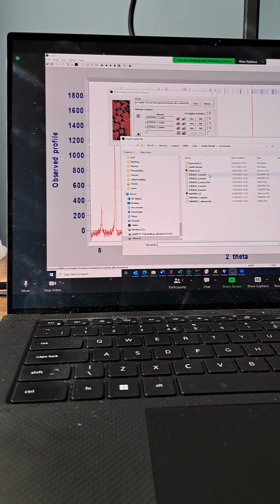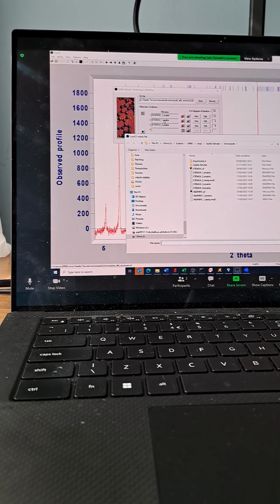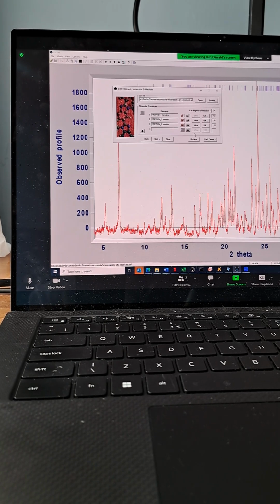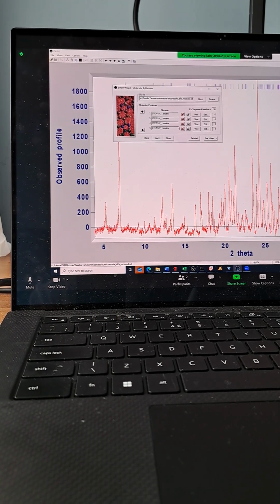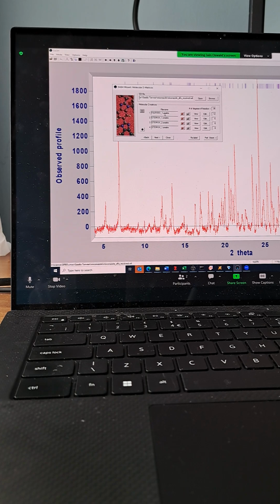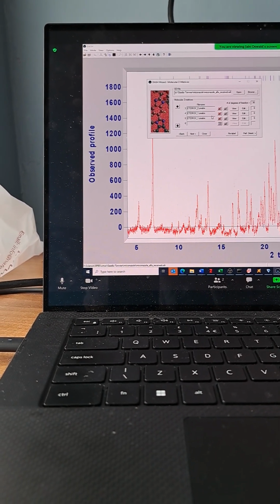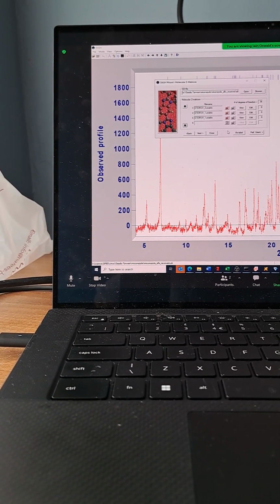on the blank tab here, what you'll have are your Z matrices. So you can see Z matrix 1 and 2. You could import either one of these, and that adds in another nitrate or water. If we want to add in another one, you open up and highlight that Z matrix. And therefore you have, say, four nitrates or whatever. It's obviously rubbish, but in this case it would just be water.